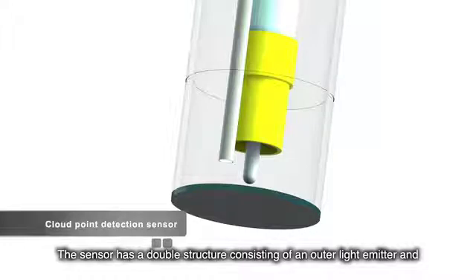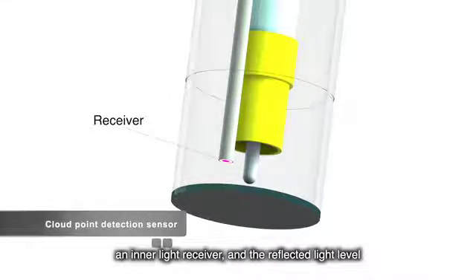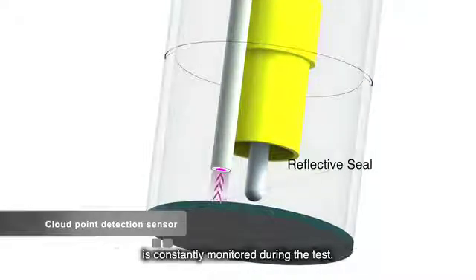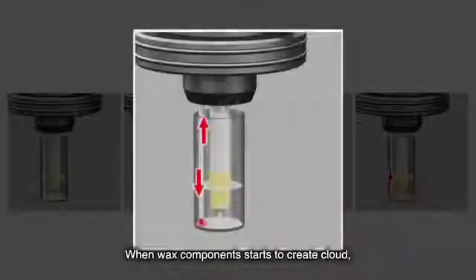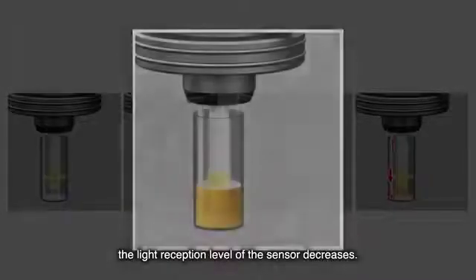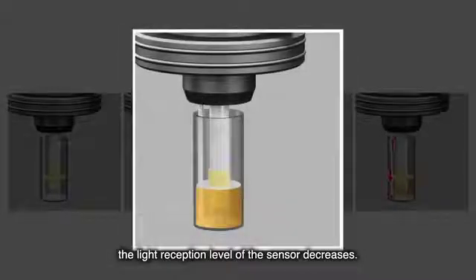The sensor has a double structure consisting of an outer light emitter and an inner light receiver, and the reflected light level is constantly monitored during the test. When wax component starts to create cloud, the light reception level of the sensor decreases.